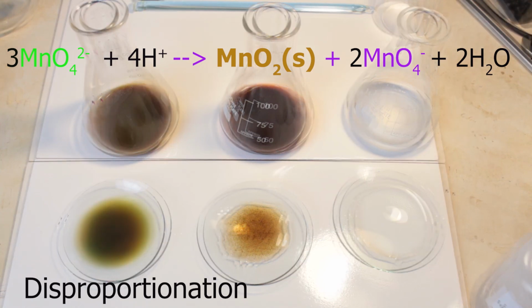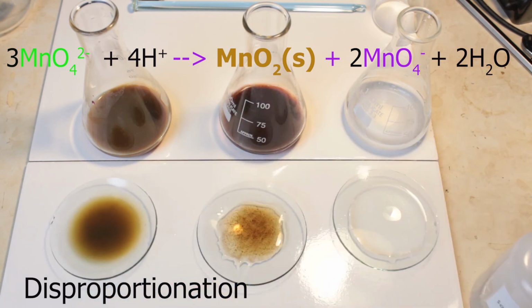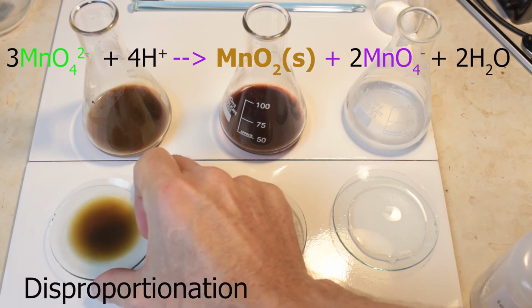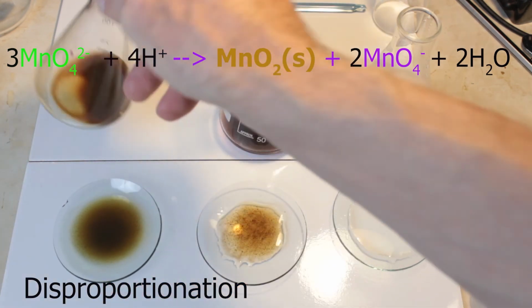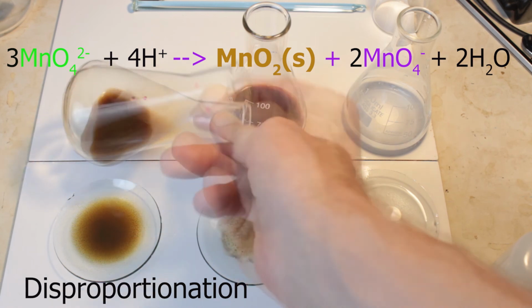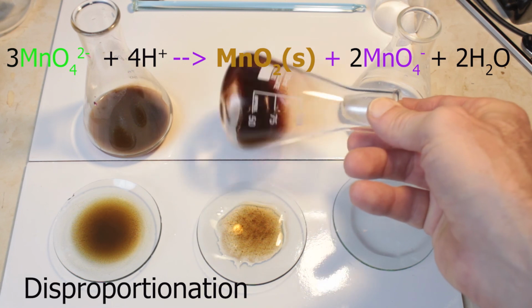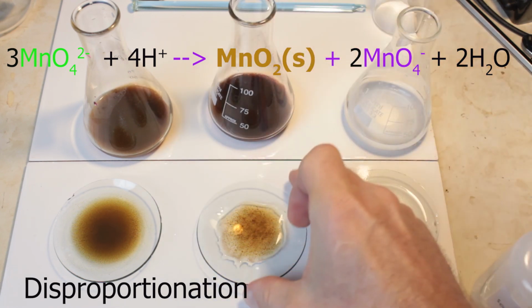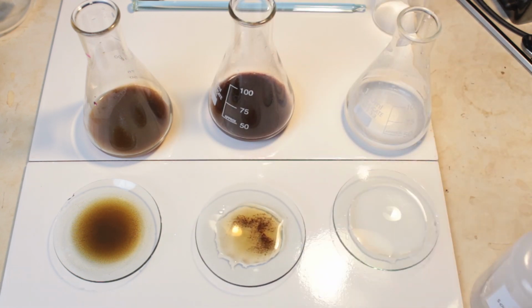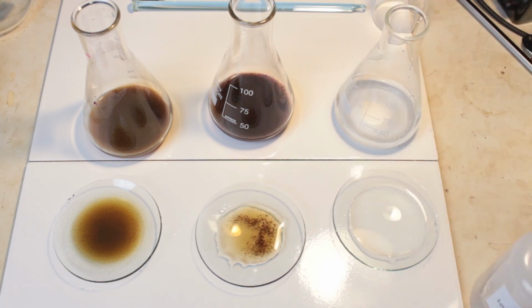So end result is brown precipitate. This beautiful green color is fleeting and exists for a very small time. It would break down, so I cannot keep it. And the result is more or less the same you see in neutral conditions in alkaline, brown precipitate. Here on the right, in acidic conditions, it's actually proper reduction of manganate 7 in acidic conditions.